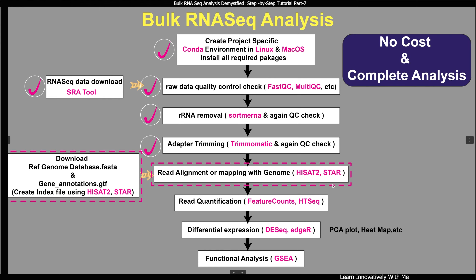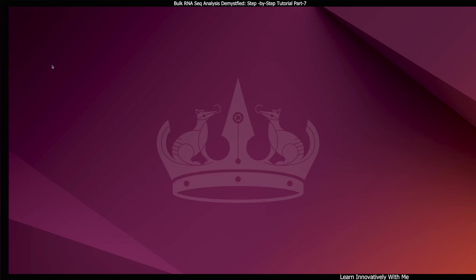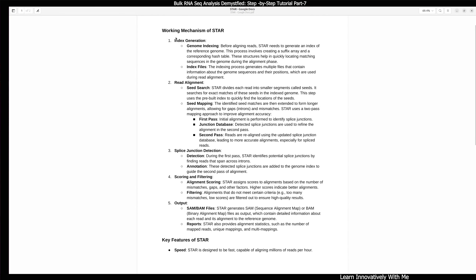STAR uses a unique algorithm making it an invaluable tool for this purpose. To ensure a smooth process we will create a separate conda environment for STAR indexing and alignment. Let's get started. Here I am showing you the working mechanism of STAR. The first step is index generation — we will create the index using the genome file and GTF file. I will show you how to download the genome and GTF file from the Ensembl website.